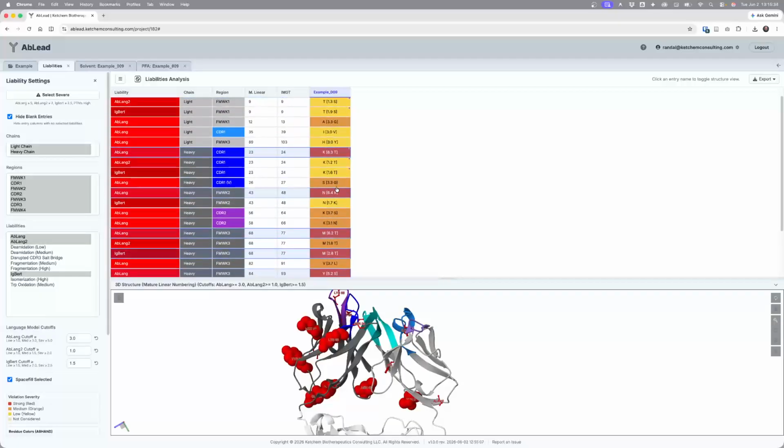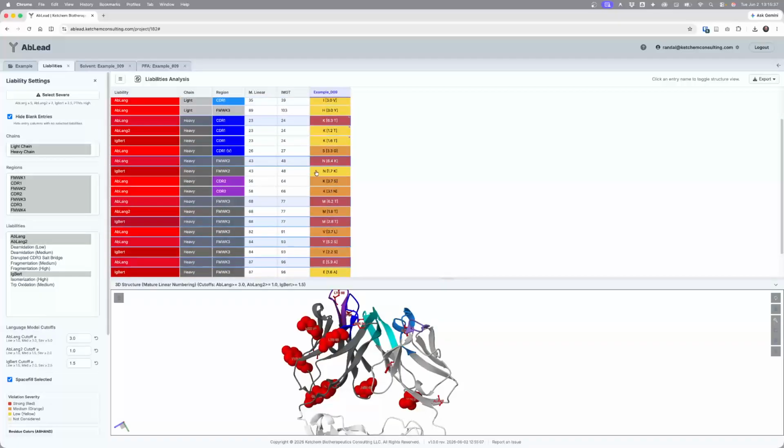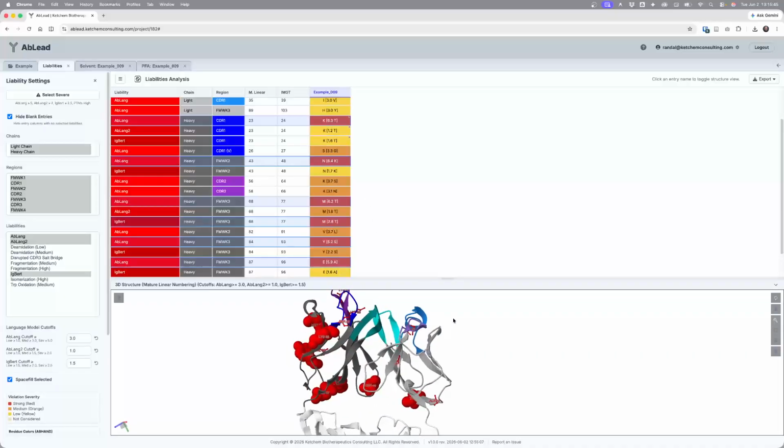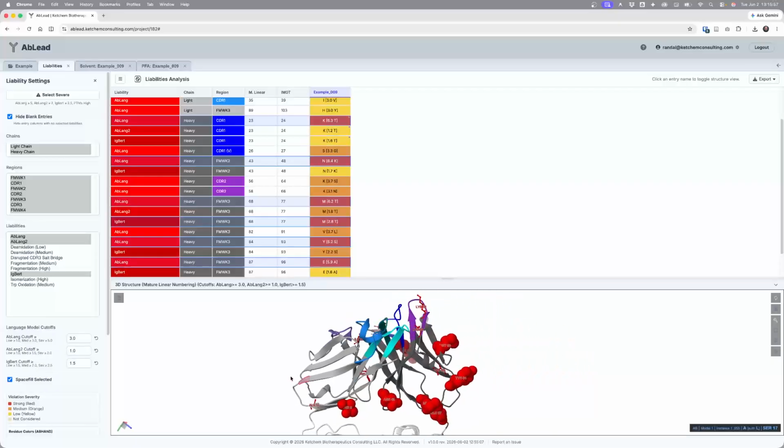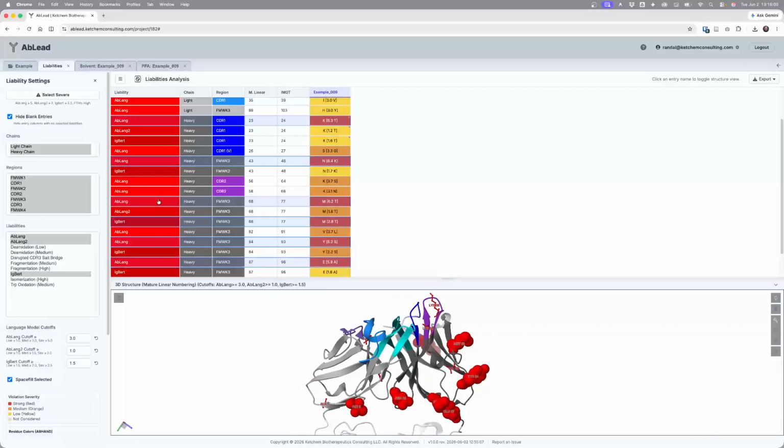So let's reselect those severe positions and keep going down the list. Well, here's position 48. Now that you see how I do an evaluation, I'm going to do this quicker for the sake of the demo. This position is one of those that is near the bottom, not likely to have impact on antigen. Let me rotate this around so you can see it better. Oh, it maintains showing because it's a violation in two different positions. So it's right here on the side.